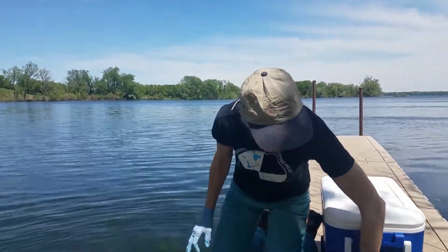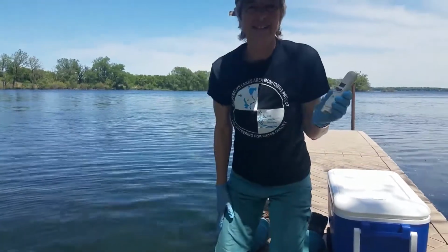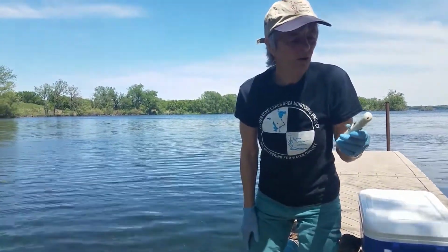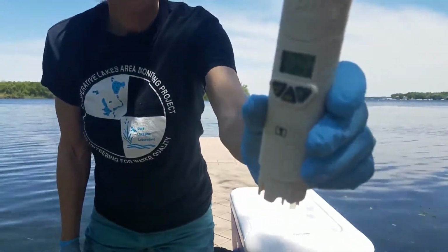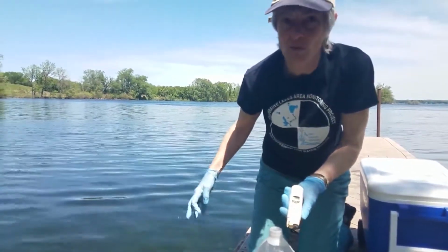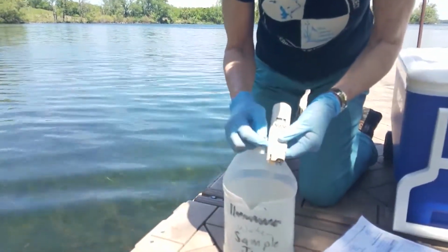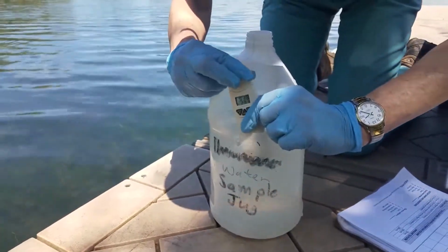I've got my pH probe ready, so I'm going to power it on. It doesn't really need to warm up like the YSI meter does. You know it's ready to go when you start to see some numbers on the screen. All you have to do is lower the probe into your water sample. So you're bringing the lake to yourself. You don't have to lean over the boat. We don't want you doing that. Just lower it till about the edge of where the outer cap fits, and put it in there.